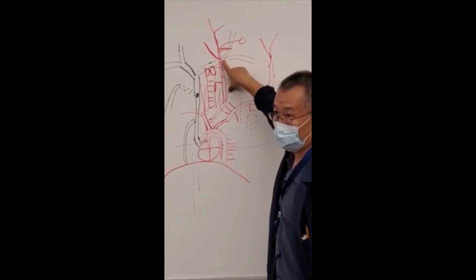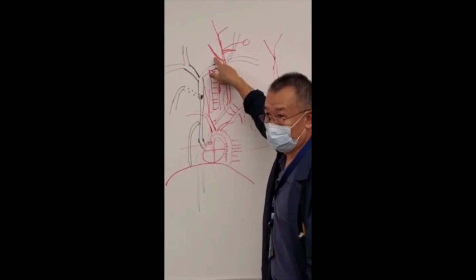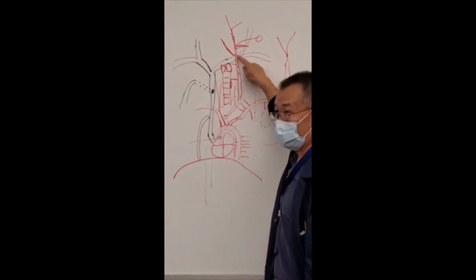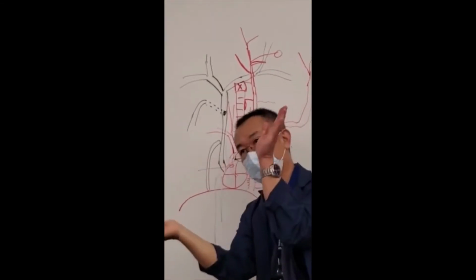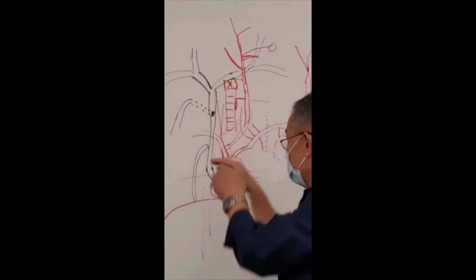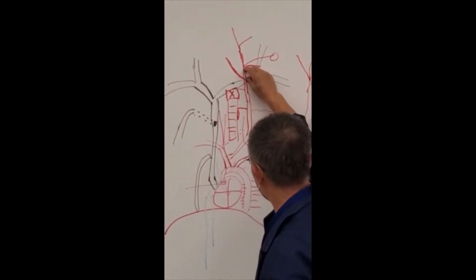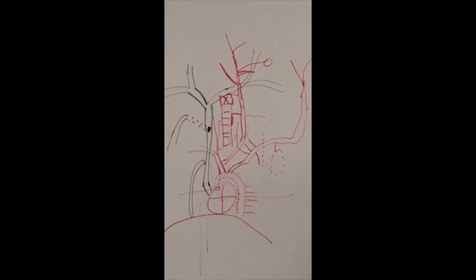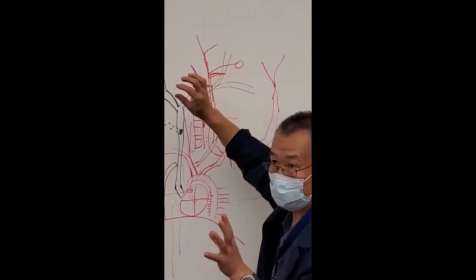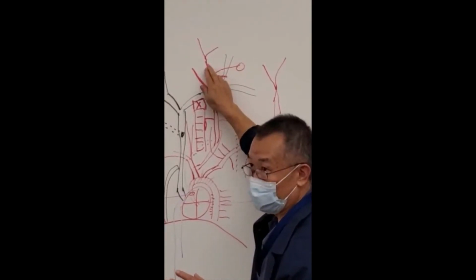There's still the common carotid. Okay, anterior lingual. So the lingual comes out. This is quite a big one. Then the common carotid, after this branch, splits. One is called the internal carotid. One is the external carotid. The internal carotid goes this way, getting inside the skull. The external keeps going, so this piece is very short. The external carotid quickly branches. You get a bigger one. That's the internal maxillary. Another one, external maxillary.